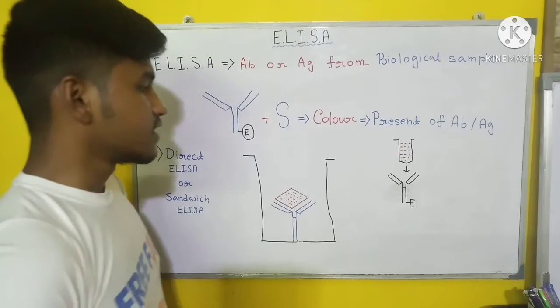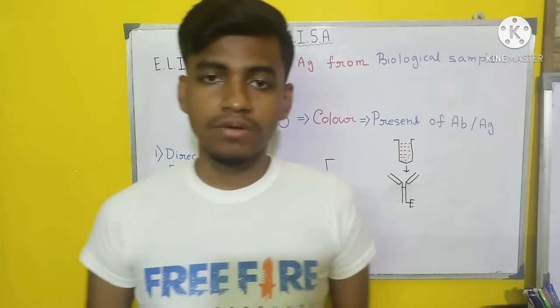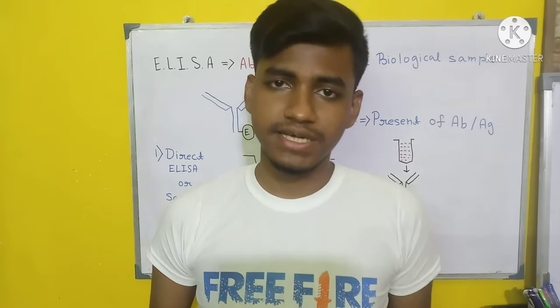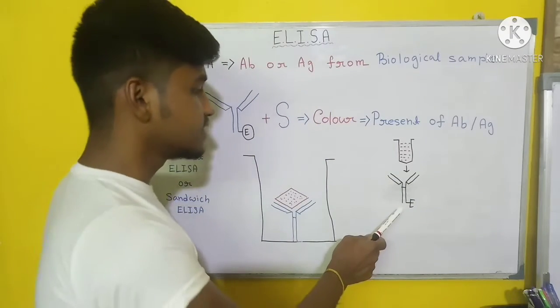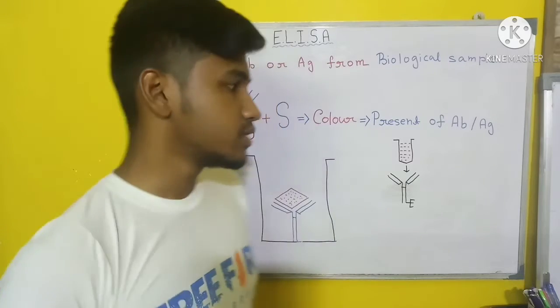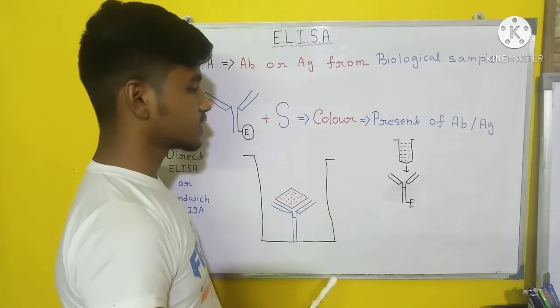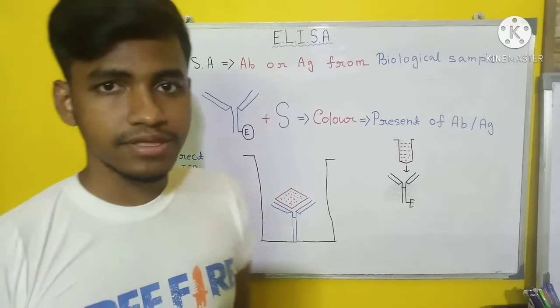This enzyme linked antibody is designed in the lab for the particular antigen that we want to detect, so that we can detect this particular antigen from the serum sample.